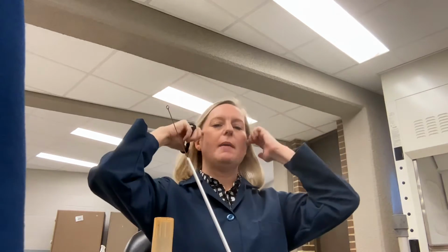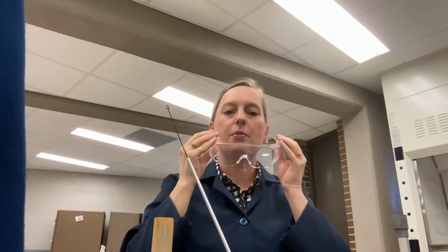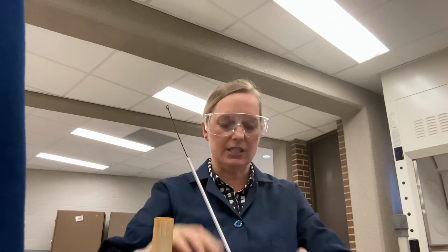So before we begin, let's make sure we have all of our safety protocols in place. We're going to put our hair back, and we're going to put our safety glasses on because we're working with a broth. Anytime we have a broth, we're going to make sure we have our safety glasses on.